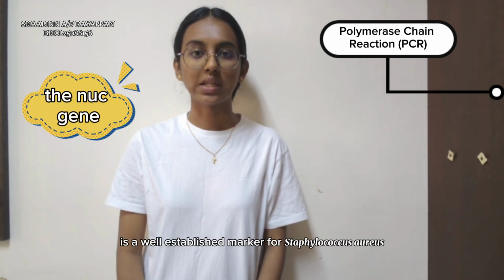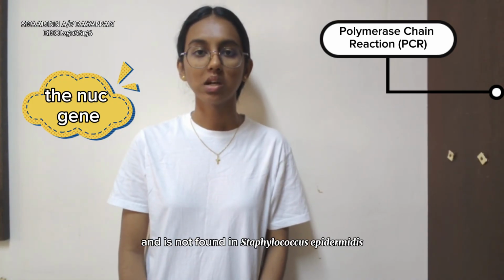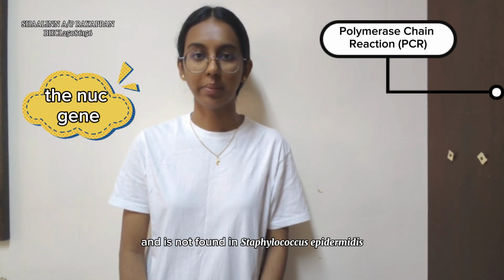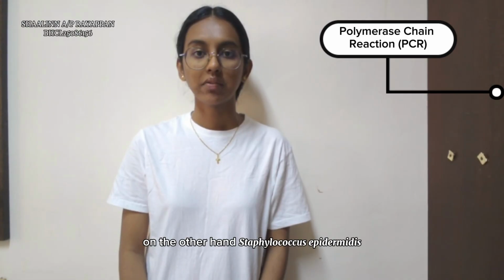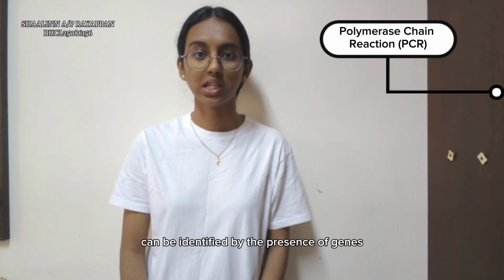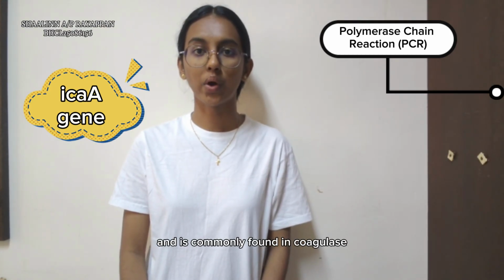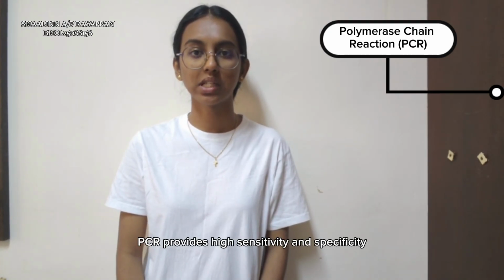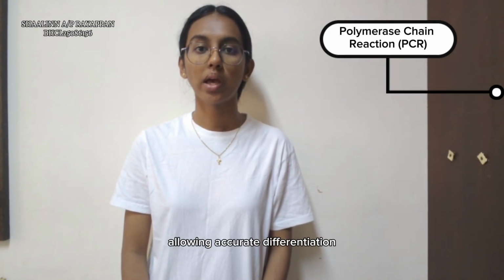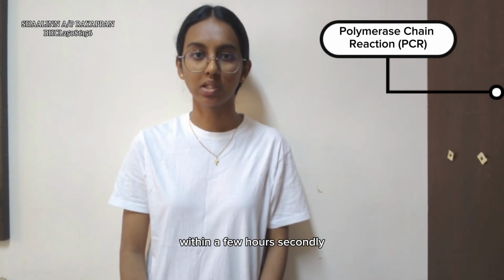The nuc gene is a well-established marker for Staphylococcus aureus and is not found in Staphylococcus epidermidis. On the other hand, Staphylococcus epidermidis can be identified by the presence of genes such as the ica gene, which is associated with biofilm formation and is commonly found in coagulase-negative staphylococci. PCR provides high sensitivity and specificity, allowing accurate differentiation between these two species within a few hours.